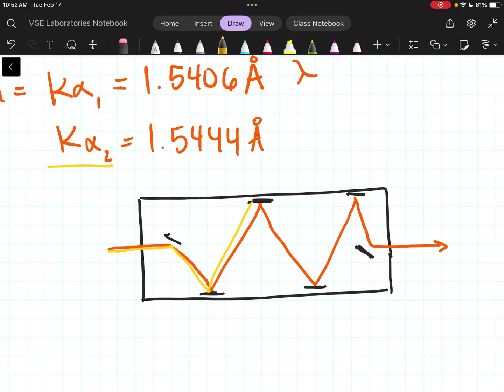So they come in together and it gets reflected just a little differently, and again a little differently. By degrees, it's getting reflected differently enough. You see how I deviate slightly here, a little bit more here, and here, until that X-ray is lost inside the monochromator, and we end up with just the orange coming through.